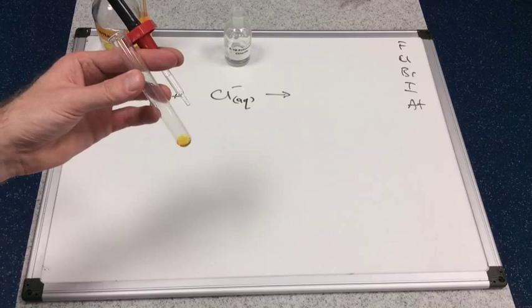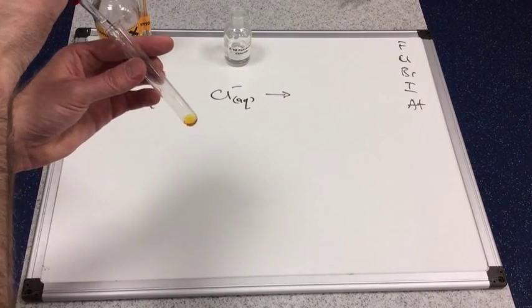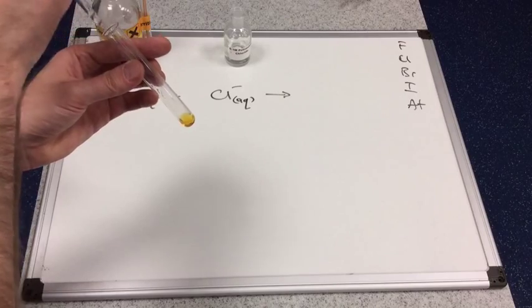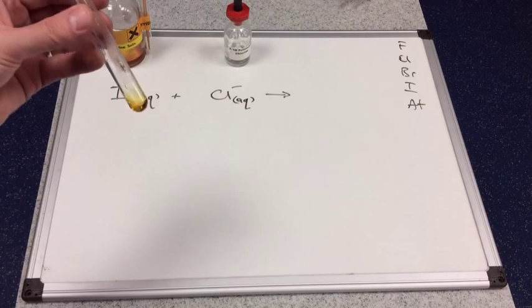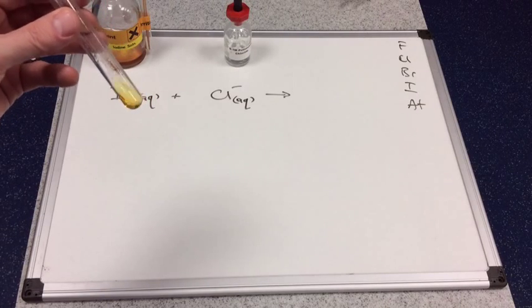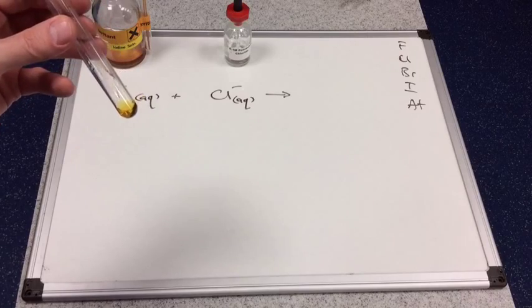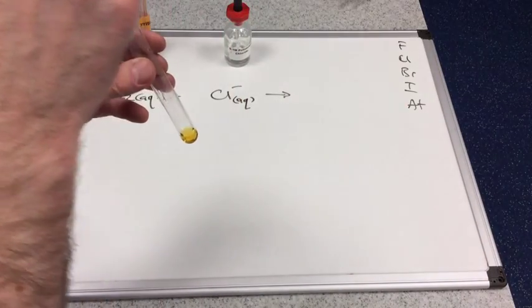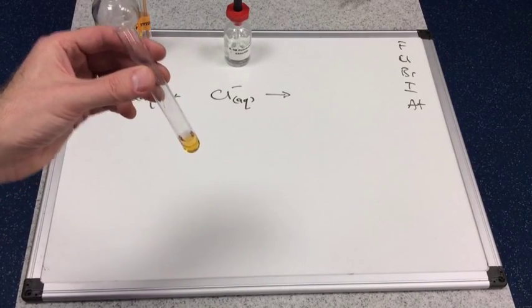Put the iodine into the test tube. I've got my chloride ions inside the dropper, let's put them in and see if anything happens. It doesn't look like anything's happened. There's certainly no dramatic color change. So what we need to do is add some cyclohexane to see which halogen's in this test tube. So just put that in, give it a shake.